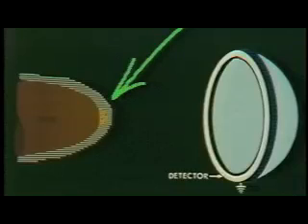Cool it to 20 Kelvin and spray liquid onto the surface. And that liquid condenses into an amorphous ice layer. Now, if you choose the liquid carefully, we've used benzene, but this summer we found water works as well, which is wonderful if you do biology. What you find is this ice layer can be removed at very low field strengths, about 0.3 of a volt per angstrom.